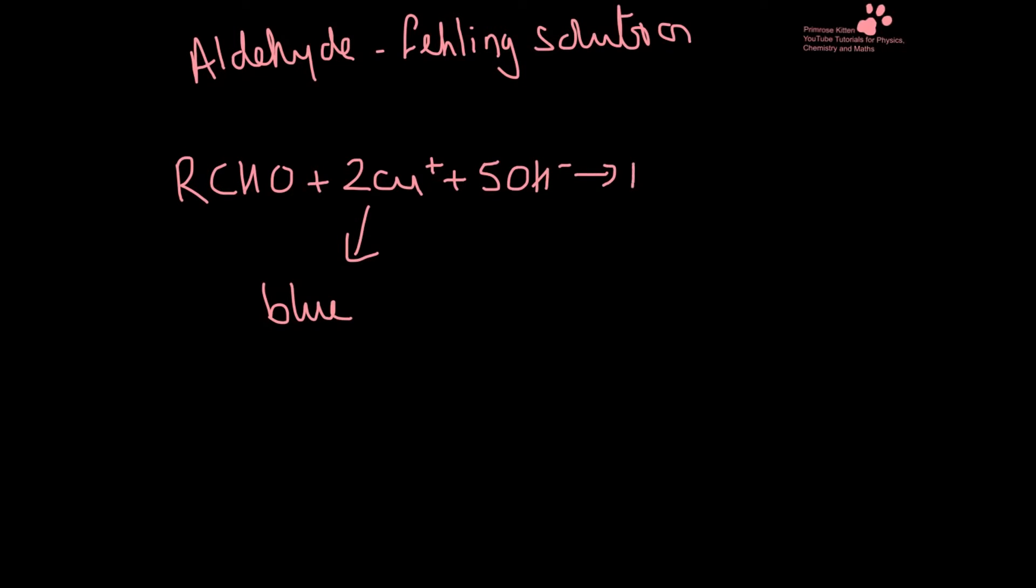After the reaction has taken place, the copper ions have reacted and are now red, although it's more of a browny mud color.